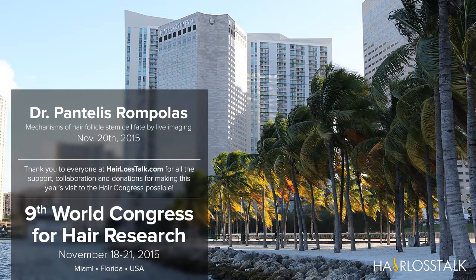Bruce, mic 3. So those photoactivatable lineage studies are just absolutely gorgeous. And I had mentioned in my talk that the matrix progenitors that we labeled, we could see them moving along the plane of the DP up into the higher regions. And that was technically limited because we label the bottom cells. We can only see them go up. So when you did these experiments, can you tell if that's a unidirectional property or whether they can actually go down as well?